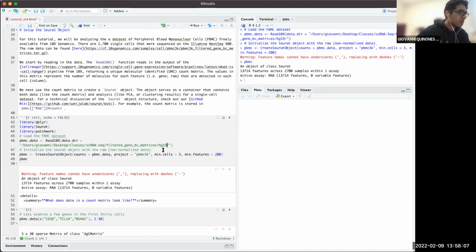Okay, I think we can wait a few minutes for everybody to update their path and run the cell. After, let's say, two minutes, we'll move on to the next step, or you can let me know if you need more time.